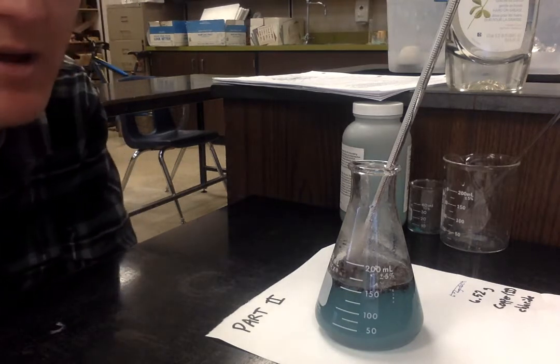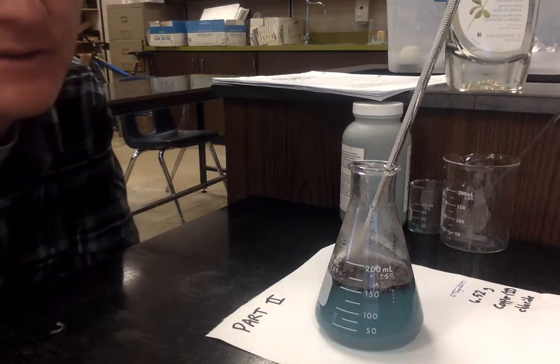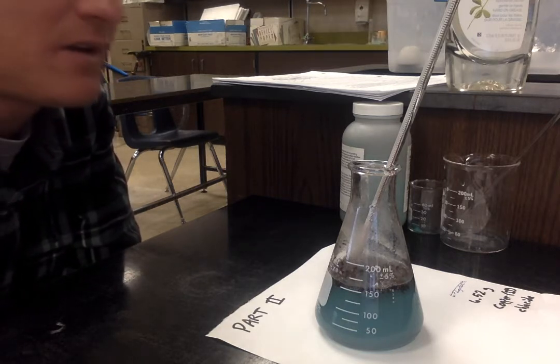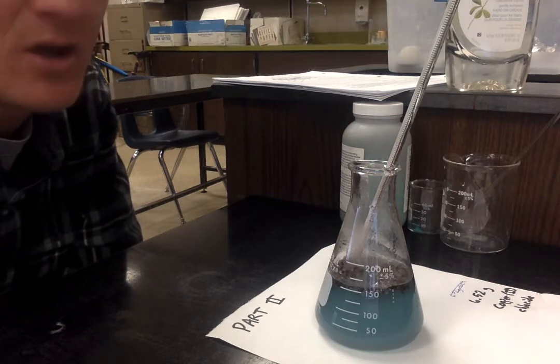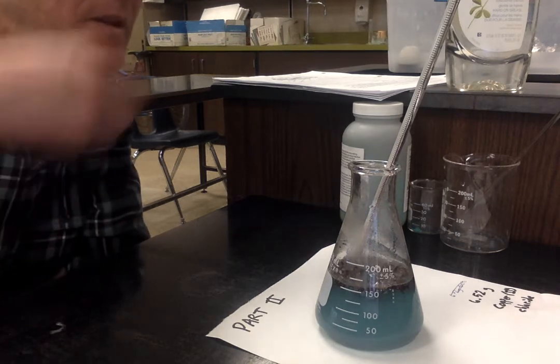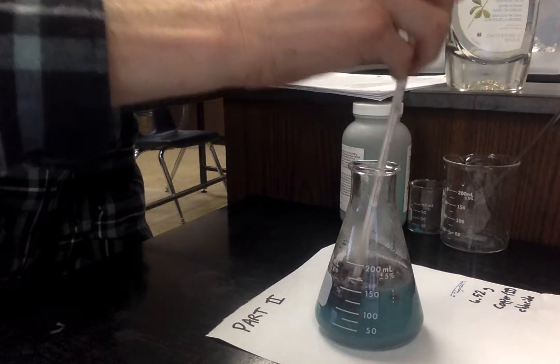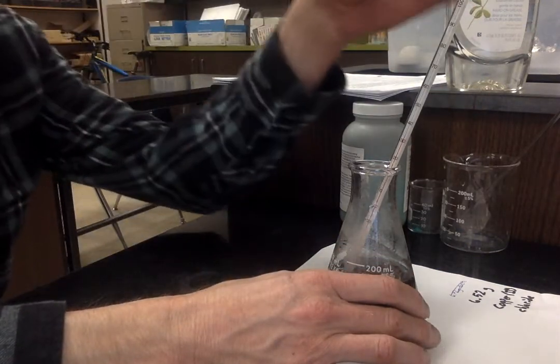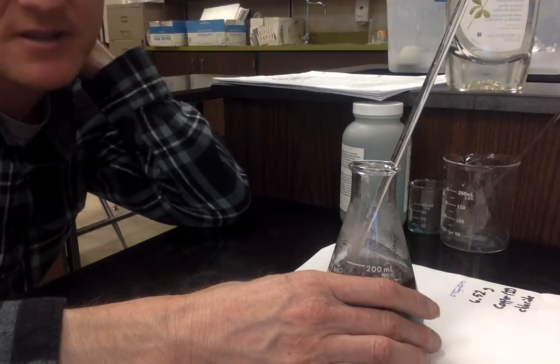This should lead you to think about what it is that made the solution blue in the first place. Notice that there, instead of the shiny aluminum, we have a coppery brown color. The aluminum appears to be disappearing, while the blue color of the solution also disappears. Anyone in Science 10 or Science 9 is welcome to do some research on the reaction between copper chloride and aluminum and think about what's being made. The temperature of the solution is now 33 degrees Celsius.